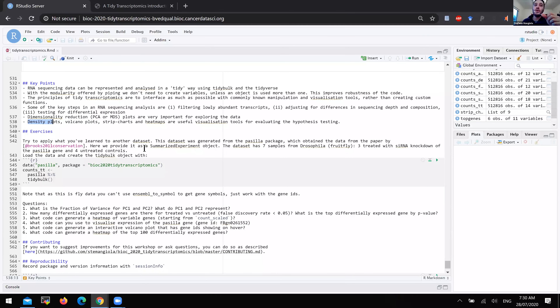Question: is the tidybulk code more compact because the path through the analysis is now clear? This is partly true. Many of the paths we take can be automated. In some cases there are multiple options, and the challenge of designing tidybulk was to allow flexibility while increasing simplicity. Through user feedback, I added more options — for example, for differential transcript abundance you can define contrasts and many other things you would define in a standard step-by-step analysis. All tidybulk functions have the ellipsis (dot-dot-dot) parameters, which pass parameters through to the backend function, so you can control backend behavior directly.